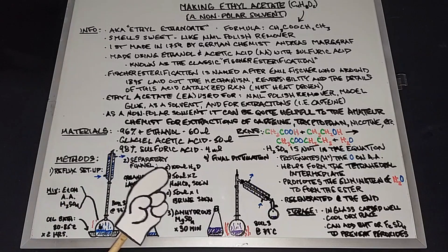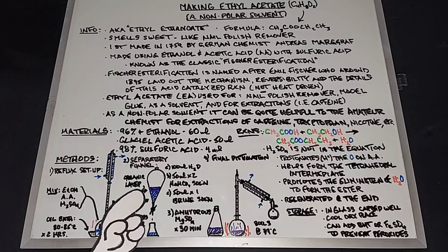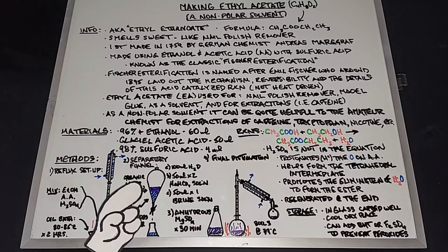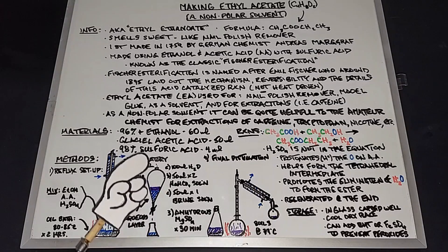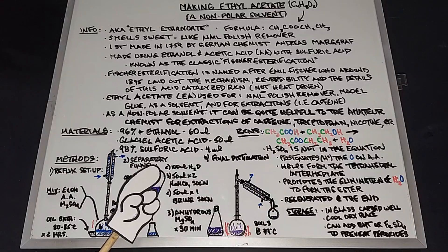Then we'll do washes twice of 50 milliliters of a sodium bicarb solution, which is mainly meant to neutralize the sulfuric acid. When we're shaking this and mixing it, we'll need to vent this quite often because of the carbon dioxide that forms. If you don't, something will definitely pop.